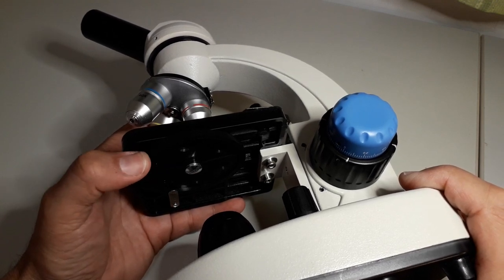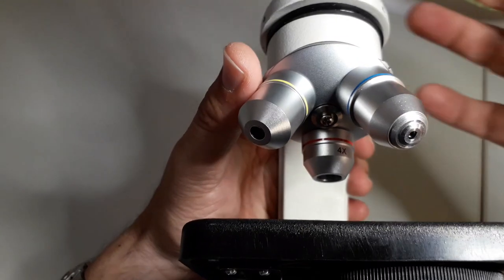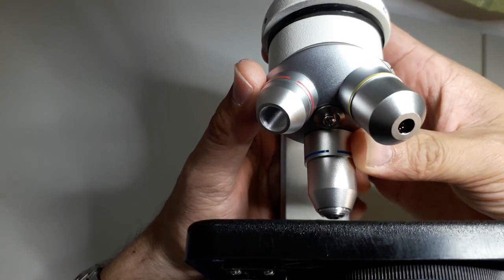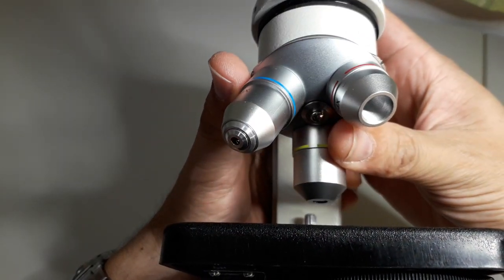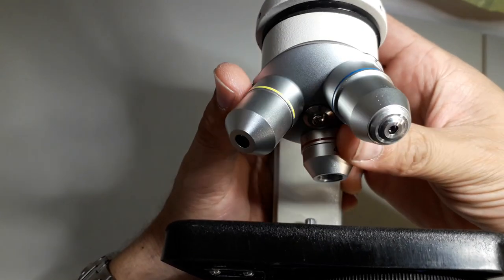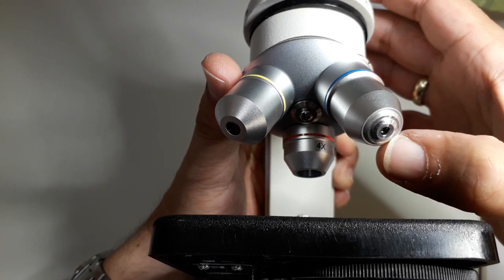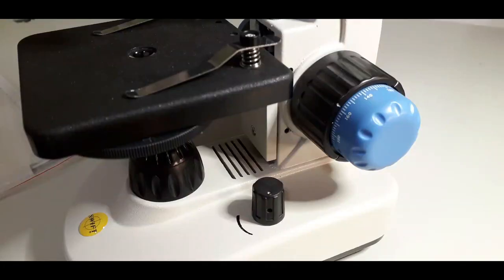And on the bottom of the stage, that is a rotating disc, which can be used to adjust the aperture. And this is the revolving nosepiece. And it has 4 times, 10 times, and 40 times magnifying objectives. The objectives have the magnification written on them. And the 40 times objective is spring-loaded for protecting the specimen slide, so you can push in the front part.